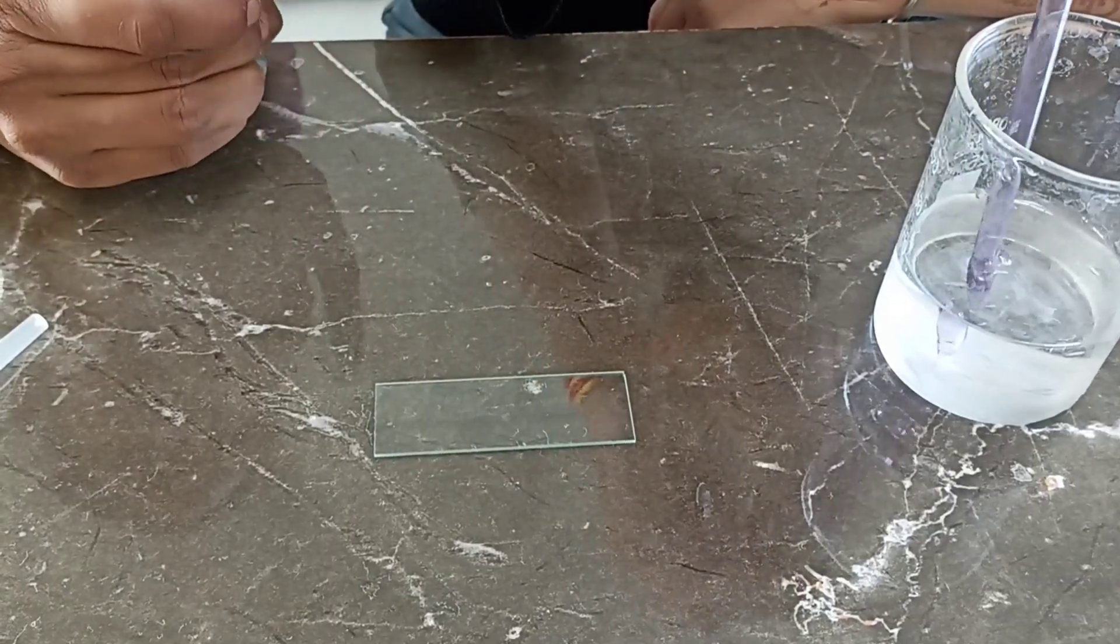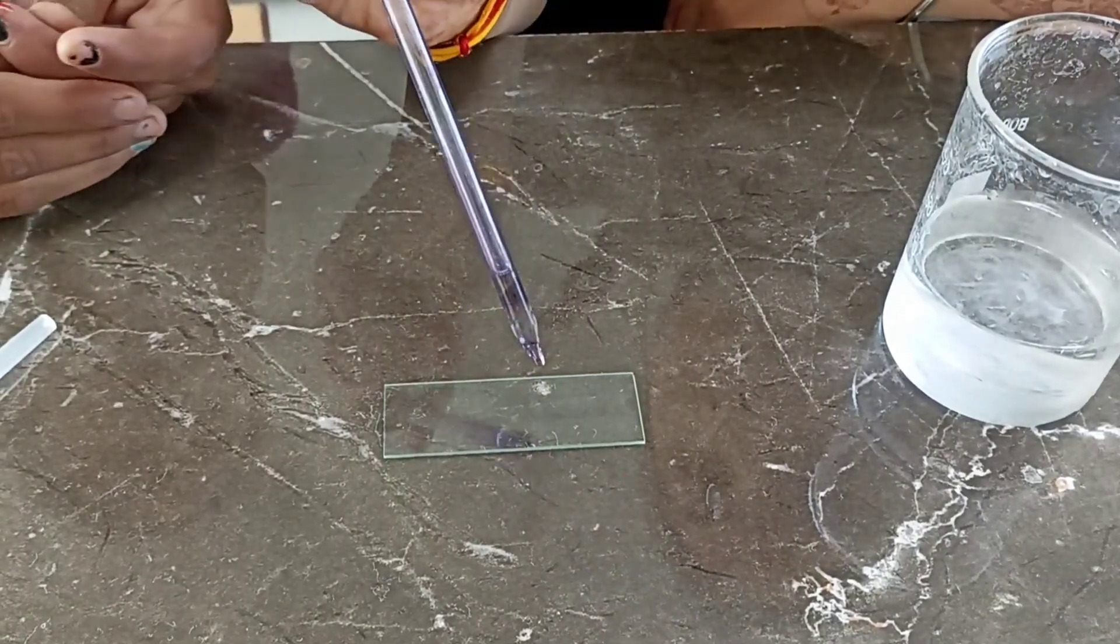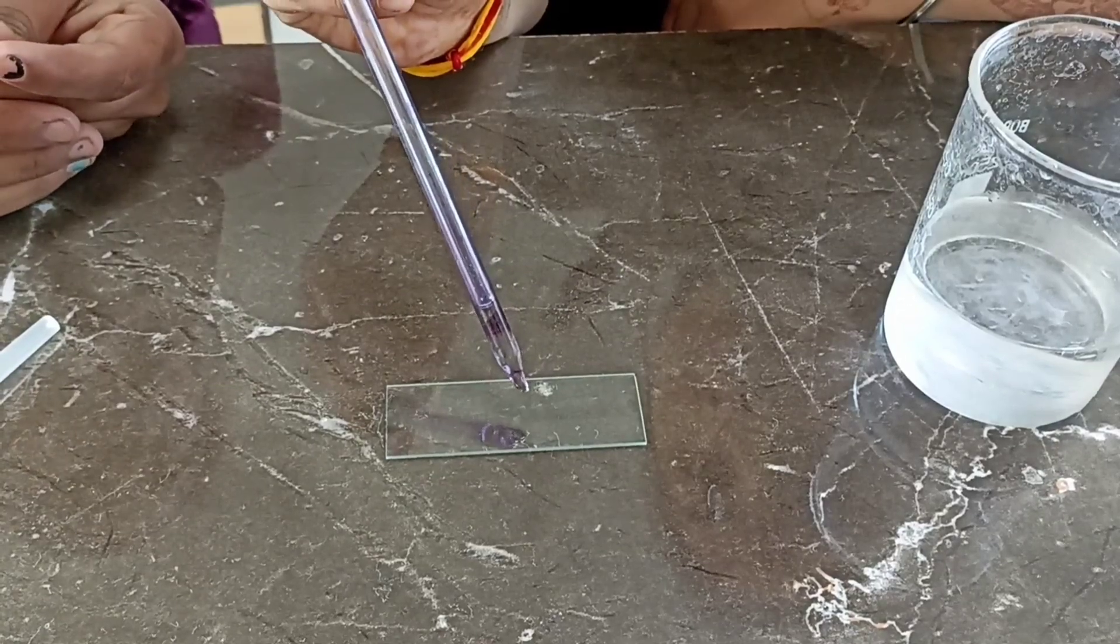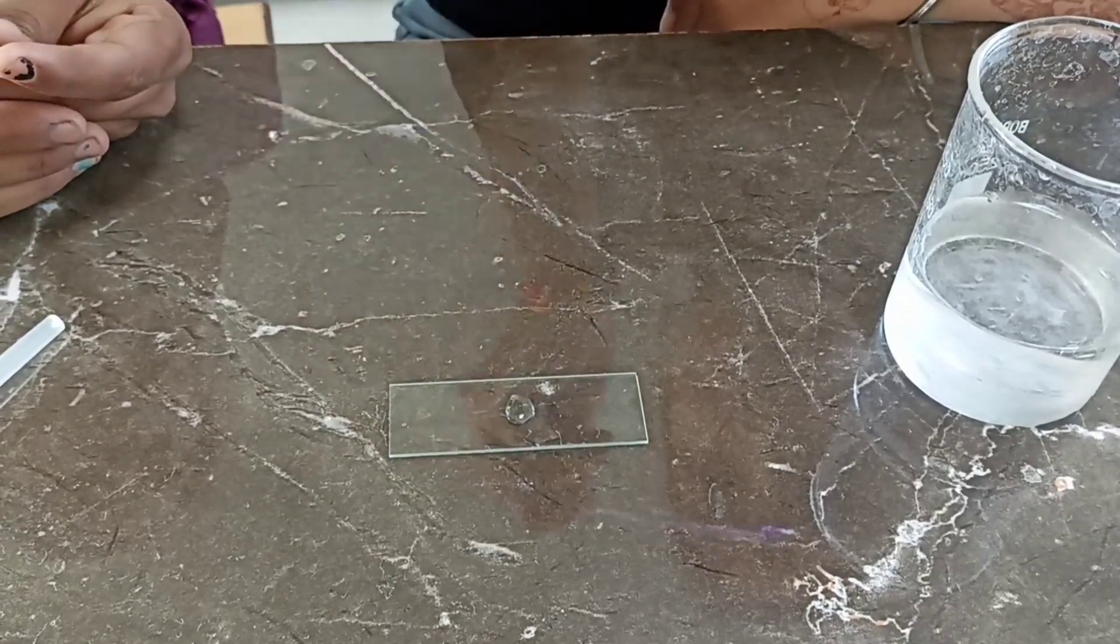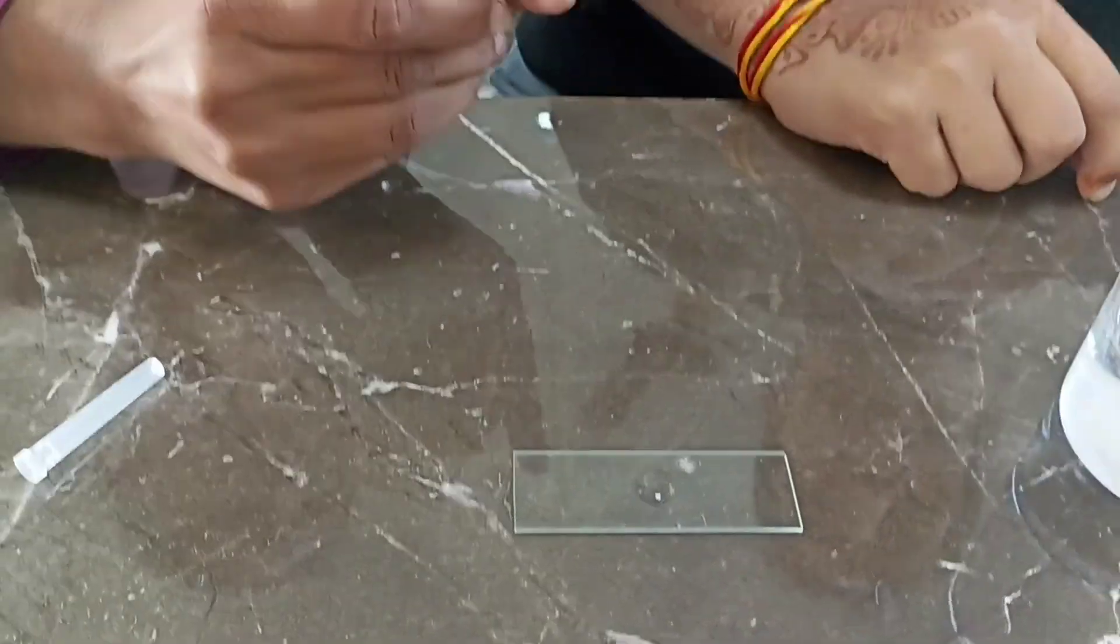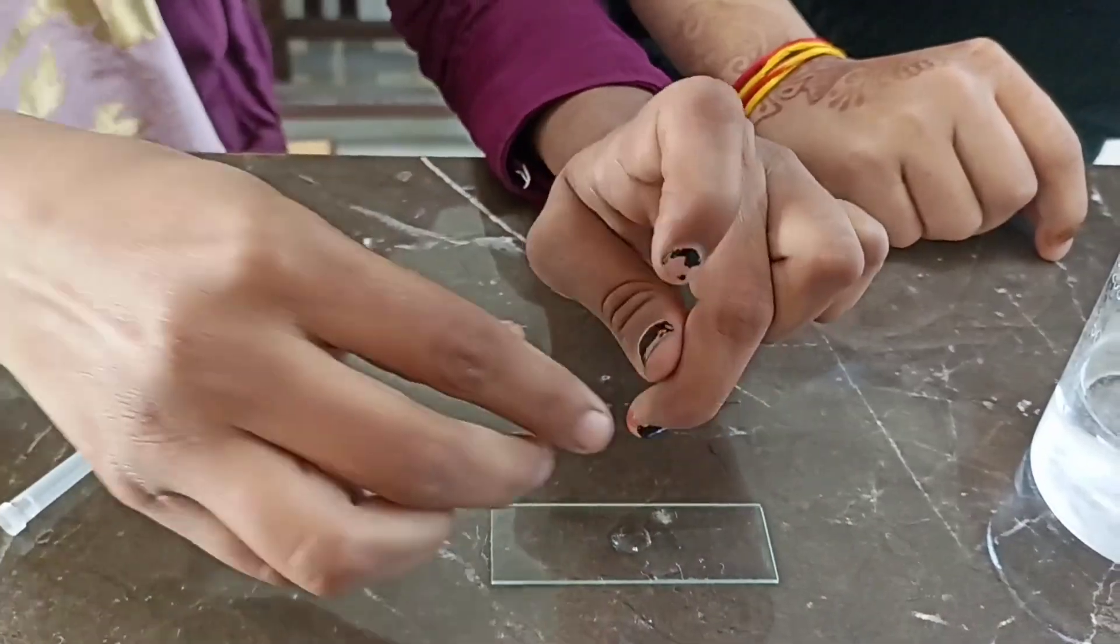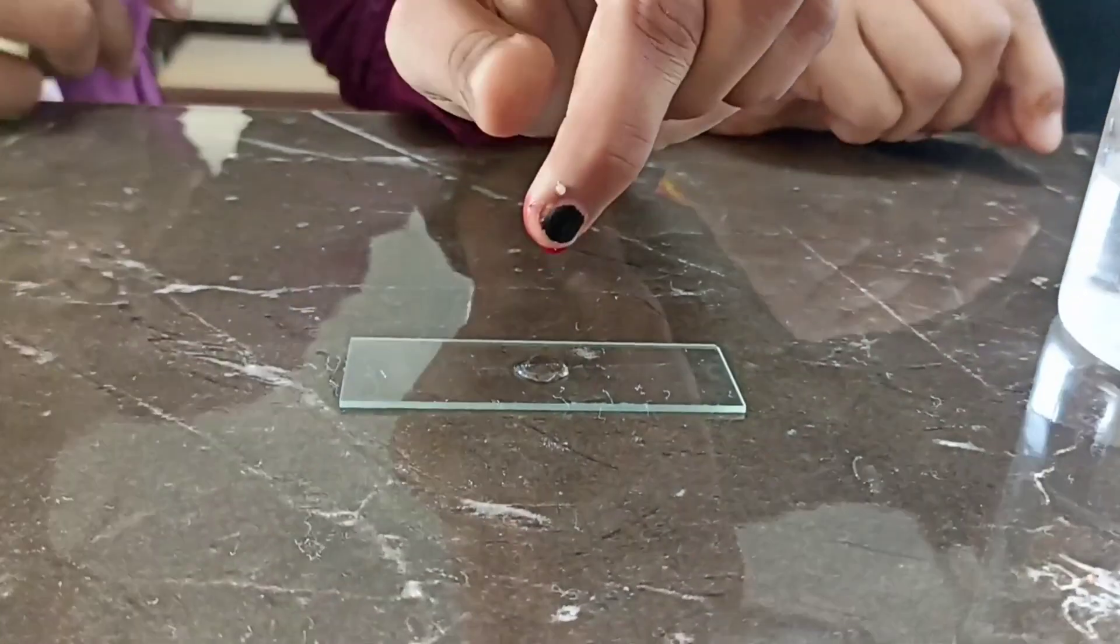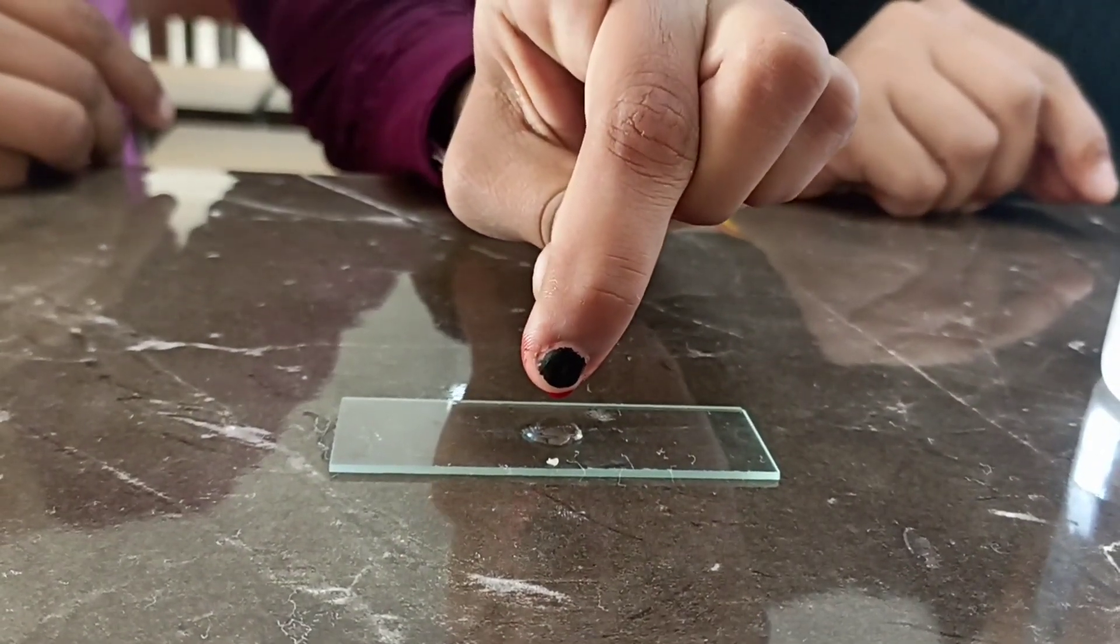Now take 1-2 drops of NaCl on the slide. On this drop, now add the blood. Avoid touching the slide.